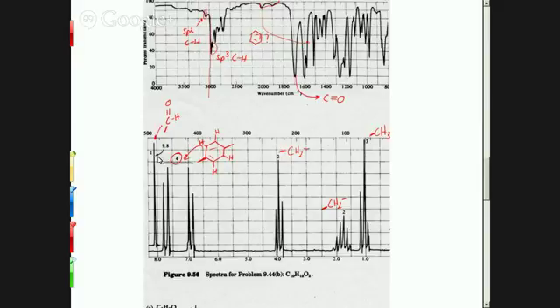All right, so now we have some choices to make, because we have a lot of different groups that are connected on multiple sides. We have two end groups, so two groups that cap ends, the CH3 and the aldehyde. We can't just stick those two together, because then there wouldn't be anything in the middle, right? That would be our whole molecule. So we have to put those things on the ends, and then we have to figure out how to put all these other little pieces in the middle. Any idea how we're going to do that?